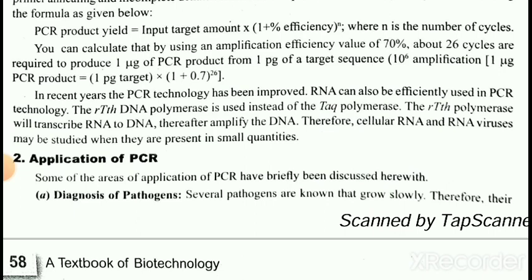In recent years, PCR technology has been improved. RNA can also be efficiently used in PCR technology. The rTth DNA polymerase is used instead of the Taq polymerase. The rTth polymerase will transcribe RNA to DNA, and thereafter amplify the DNA.